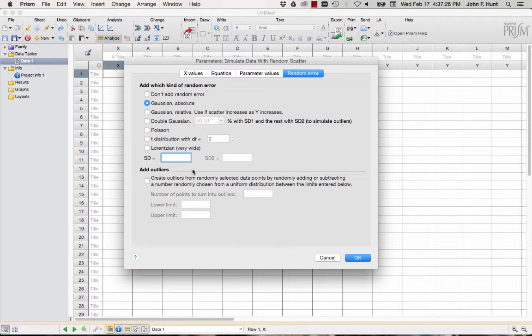the binding isotherm that we simulate will go from 0 to 1. So, 10% error at the top would be a standard deviation of 0.1. And so, again, the equation I entered is simulating fractional saturation data. And fractional saturation goes from 0 to 1. So 0.1 would be 1/10 of 1. So this would be 10% noise at the maximum value. And what we say when we're saying absolute, that means there's also an absolute 0.1 noise at all points.